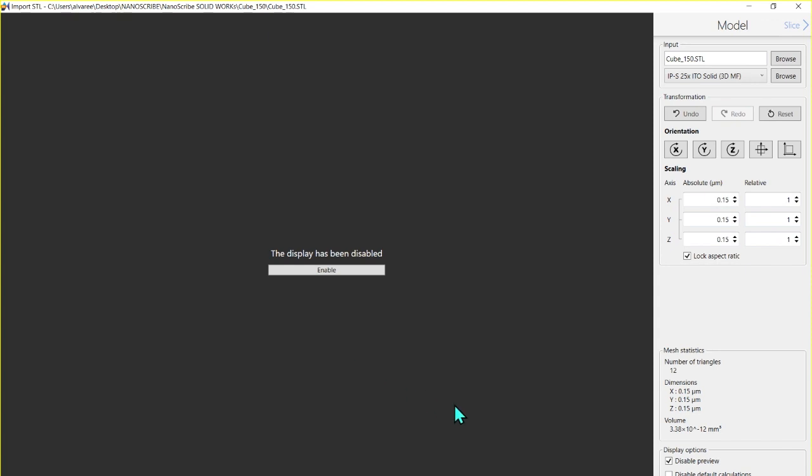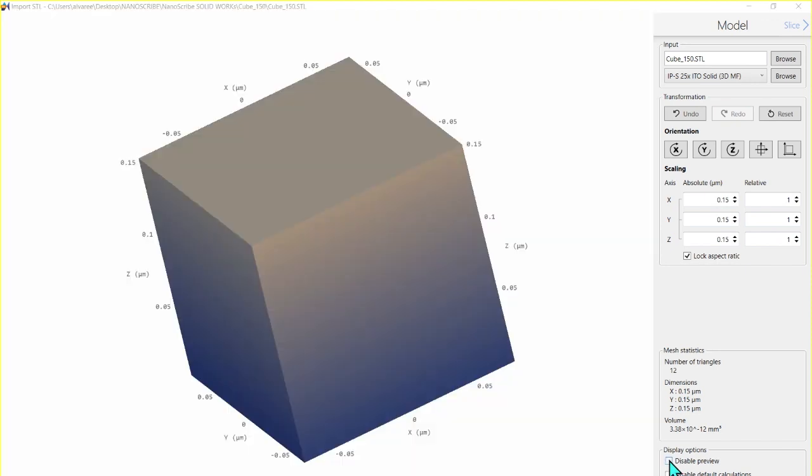stuck, okay? Because this structure is quite simple and I want you to see, I will enable it. And also you can disable the calculations, but I don't want to because I want it to be quite visible. So let's do the size that I wanted, because this is very small and I want to do this bigger.